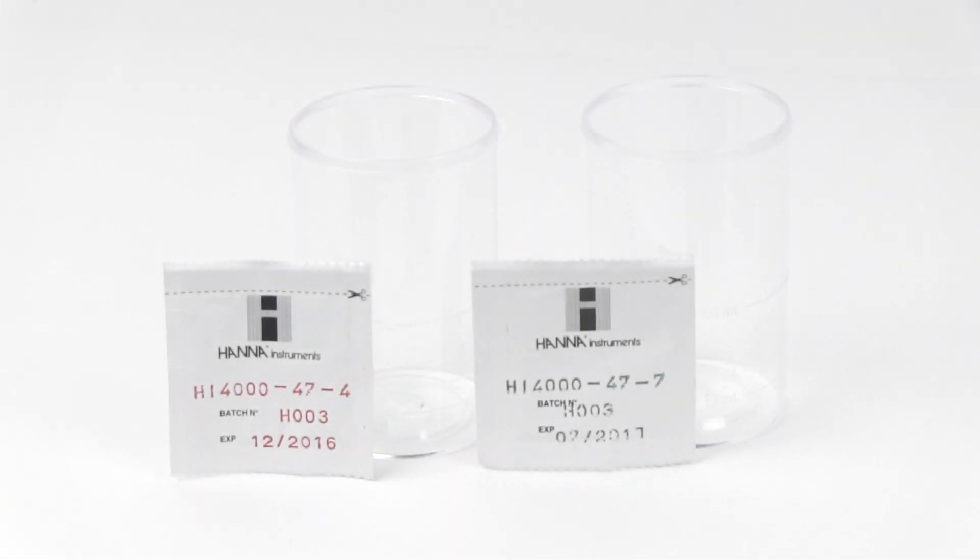Before you begin, you will need to have an HI4000-47-4 pH 4 and HI4000-47-7 pH 7 buffer packet with chloride ion background. These buffers are designed specifically for performing the slope check of the ammonia ISE. Conventional pH buffers cannot be used.